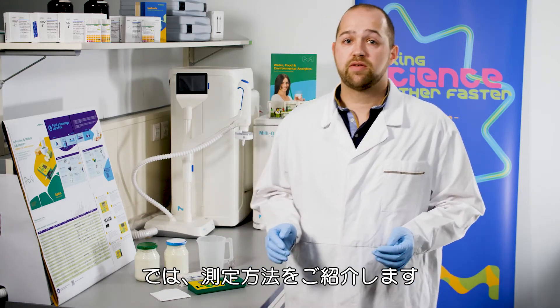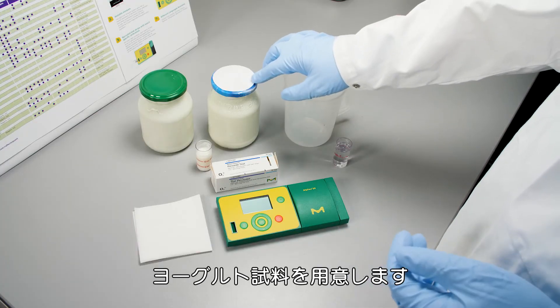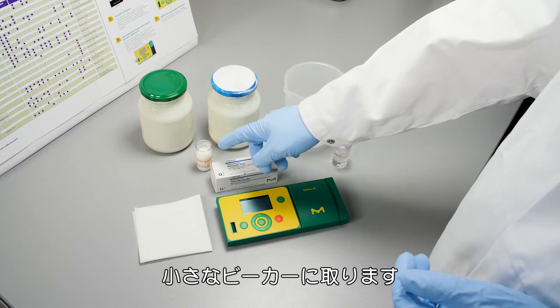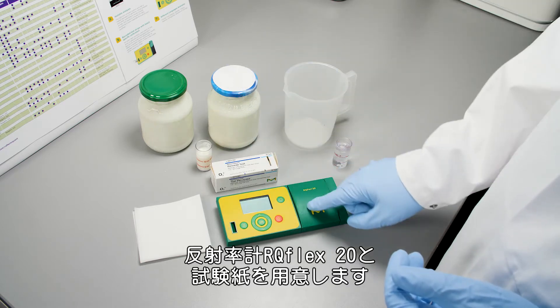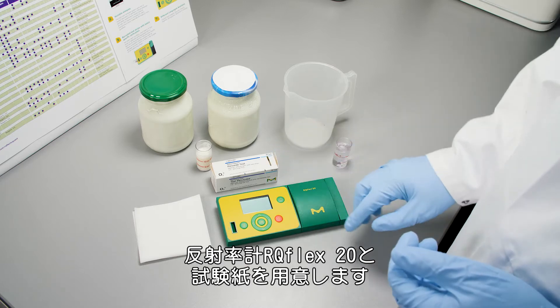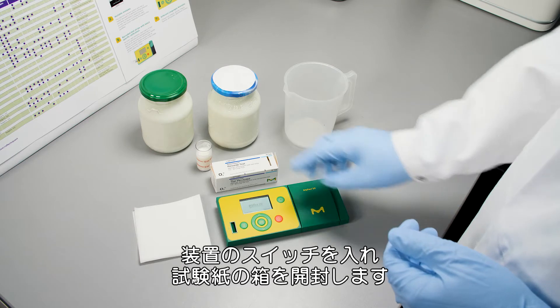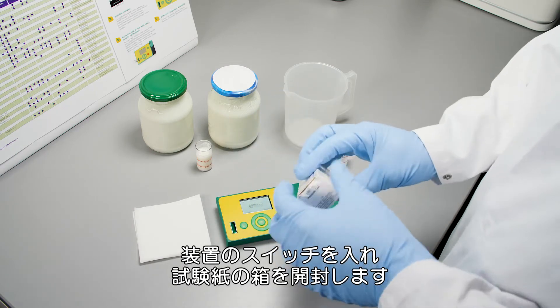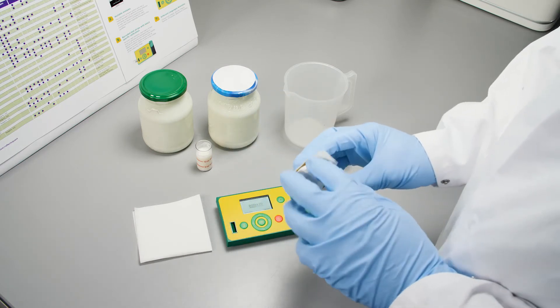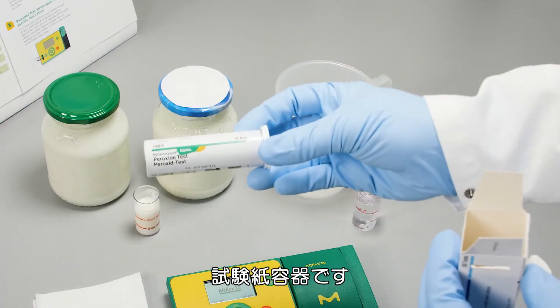Now I'll show you how the measurement works. First of all, we need our sample — normal yogurt — which we fill into a small beaker. Then we need our reflectometer RQflex 20 and also the test strips. We switch on the instrument and open the box of the test strips.